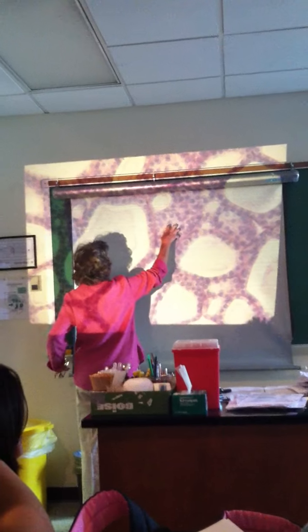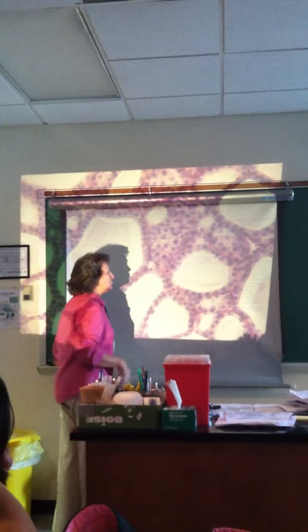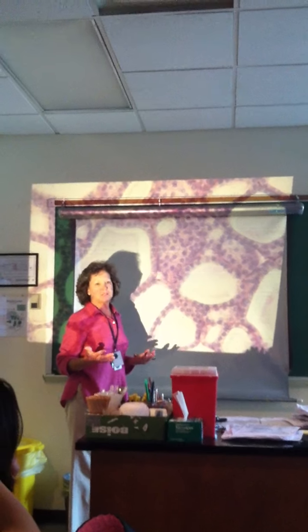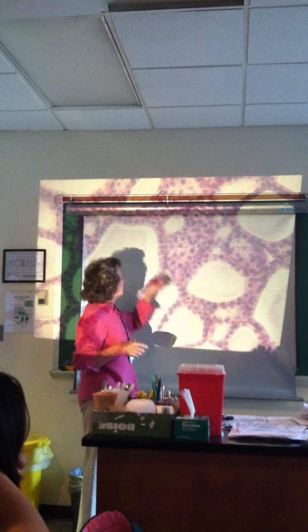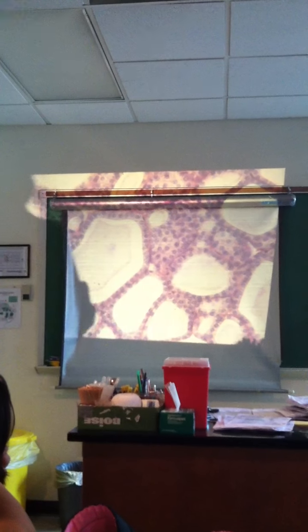Now what is happening right here is they didn't cut deeply enough to get into that follicle, and so you're looking down on it from a polar view. Would you notice it does not matter what shaped cell you are? It looks like a fried egg when you look at it from overhead. That's why we don't identify shapes from overhead.